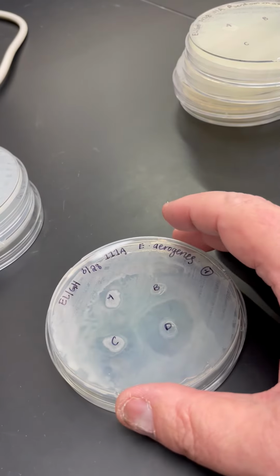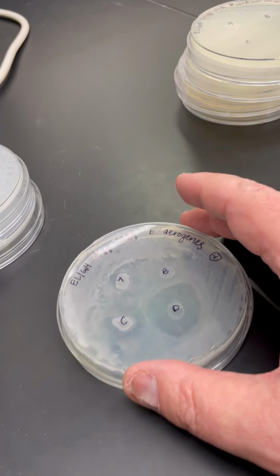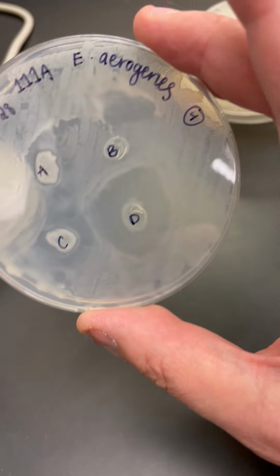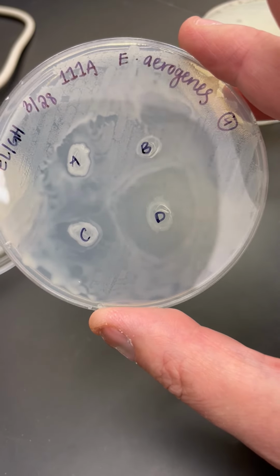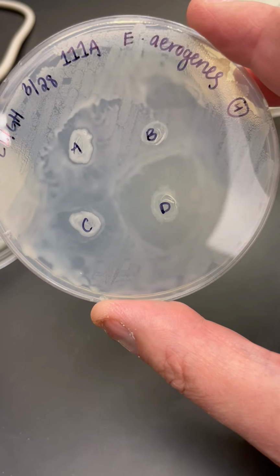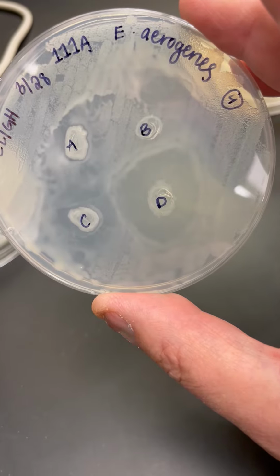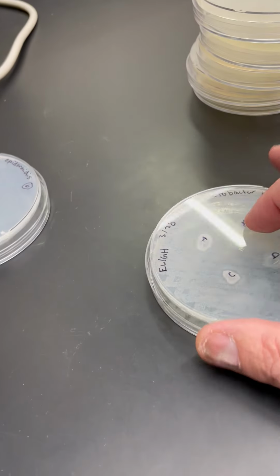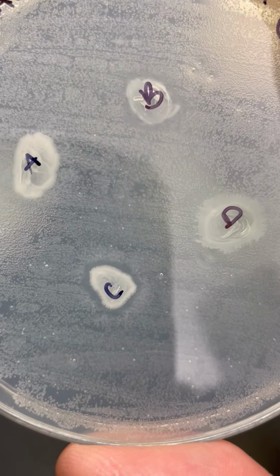How about Enterobacter? Now, I want to warn you that Enterobacter formed kind of slimy stuff on the plate, so it might be a little bit hard to see. But you would agree with me that D is having a huge effect, and so is C. So I would call D a plus plus, C is a plus, and A may actually be a plus minus or a plus, but B not at all.